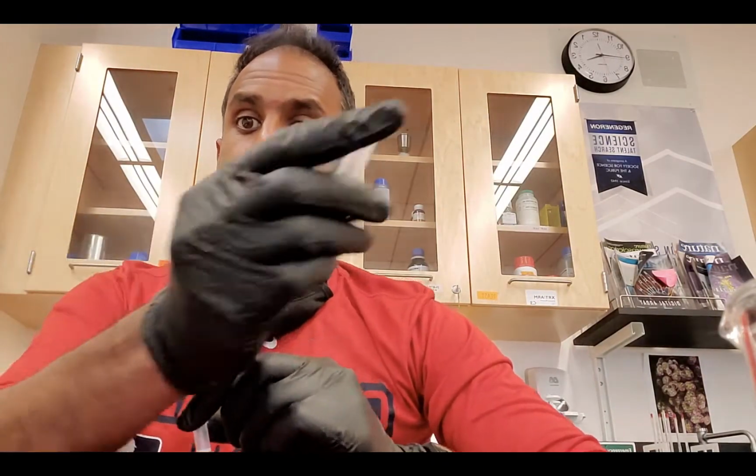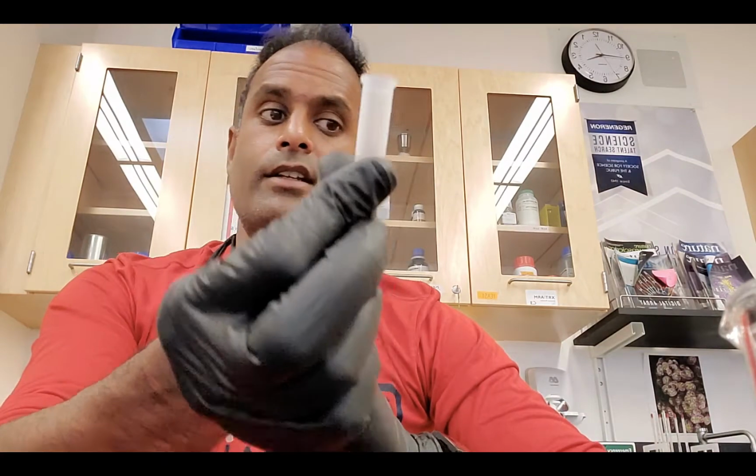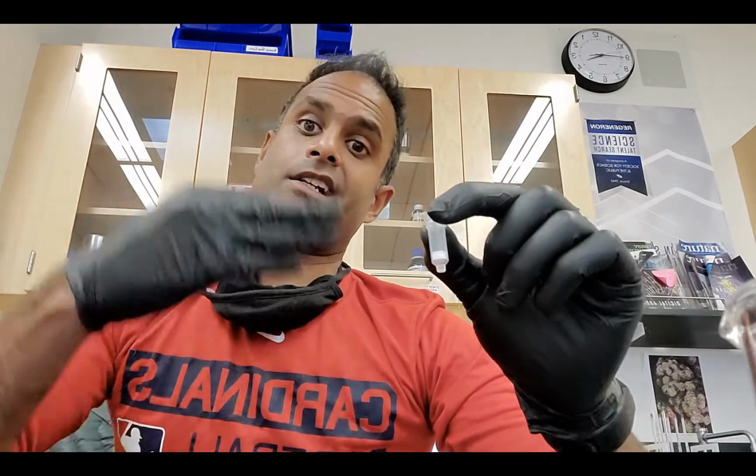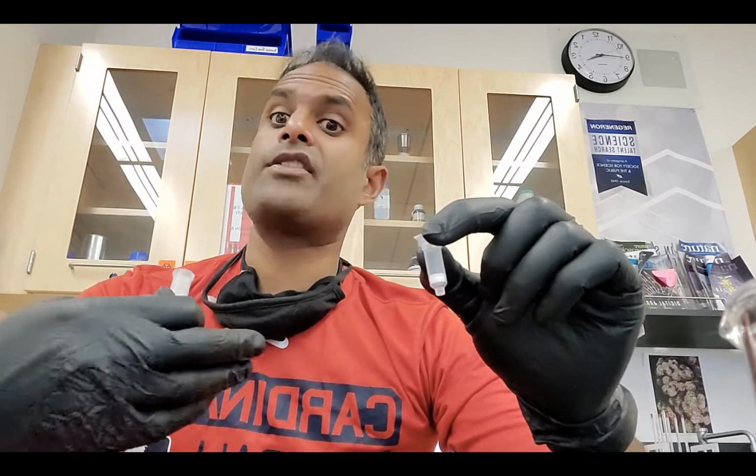So the liquid that I collect in this tube, I'm going to throw away. And it's going to be this that I'm going to want to keep until just about the last step, because again, my DNA is going to be in that white little filter. So basically, I'm going to go ahead, trap my DNA in there. I'm going to clean it by adding a little bit of detergent and then adding a little bit of alcohol. And then once it's clean, I'm going to go ahead and try to drop it out of there.